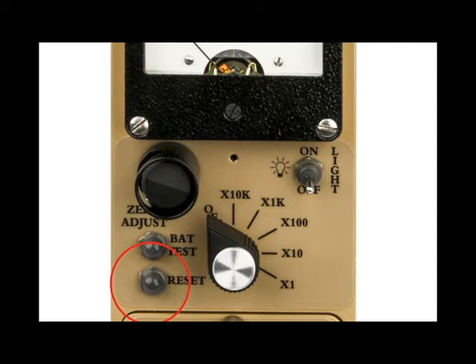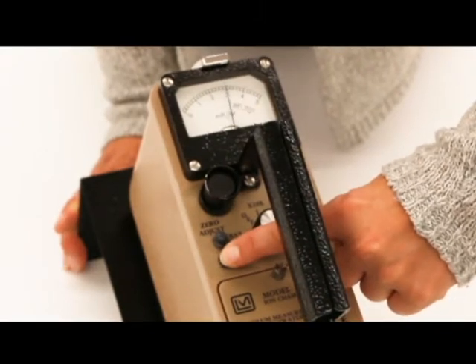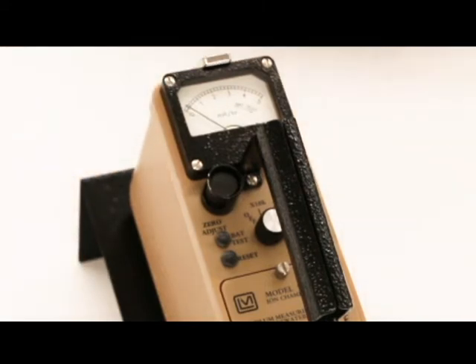The reset button is used to drive the needle to zero. On the x1 and x10 ranges, pressing the reset button induces a voltage transient. You have to hold the reset button down for 5 seconds to allow the transient to decay — the needle will indicate a countdown during this time. Similarly, when the reset button is released on these ranges, another transient occurs and another 5-second recovery countdown occurs.